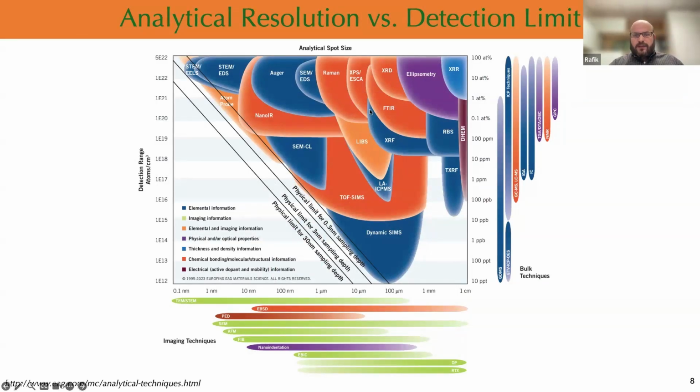Now you can see my pointer on a wide range of material characterization techniques from the surface to the bulk. And you can see that here is the surface. Here we can see all the microscopy techniques, the imaging techniques. And as we go more in this direction, it's the sensitivity of each technique. For example, if you take FTIR, the detection limit is 100 parts per million, for example 0.1 atomic percent, you can find FTIR and also AES.